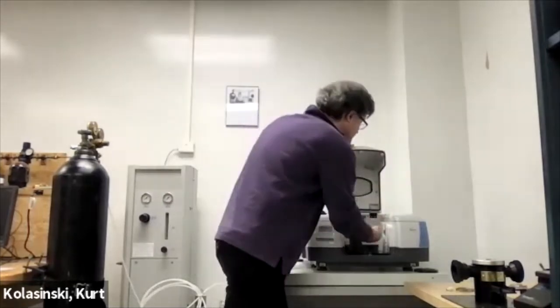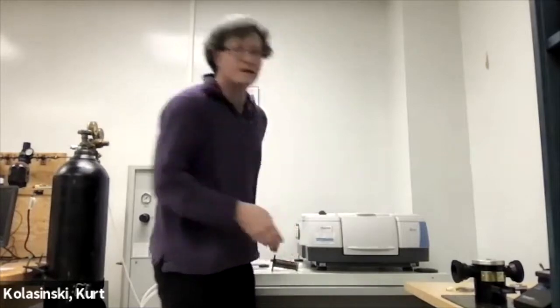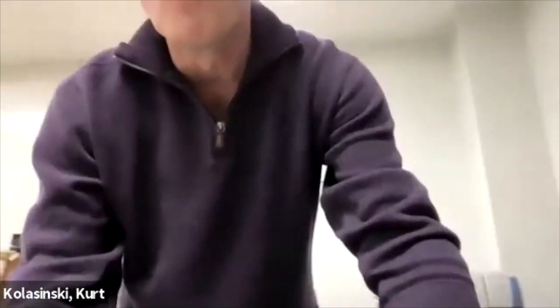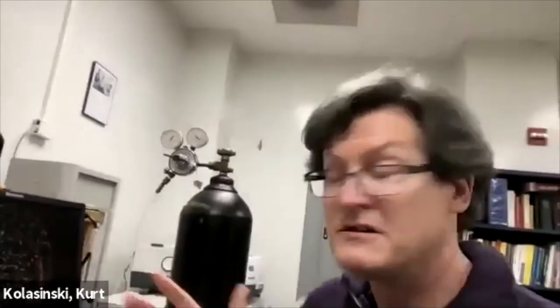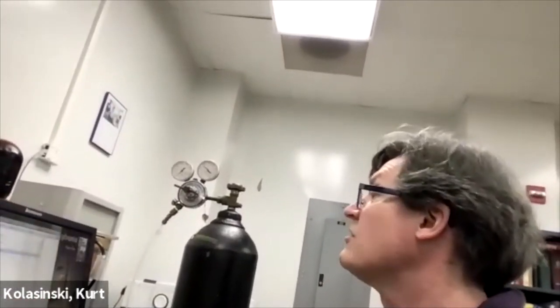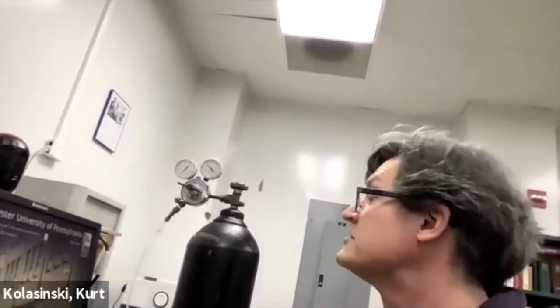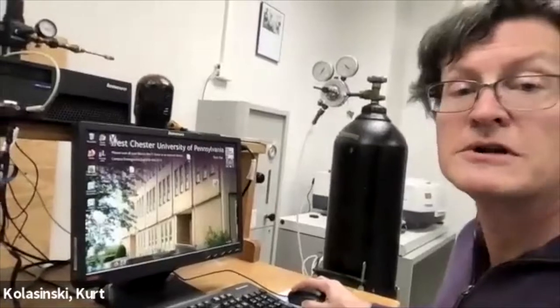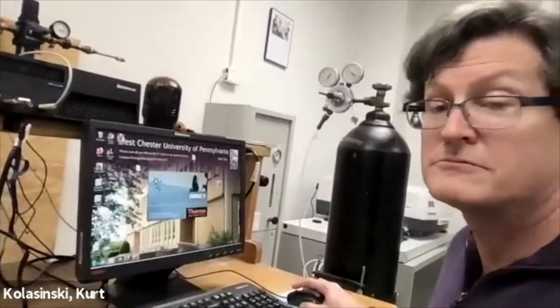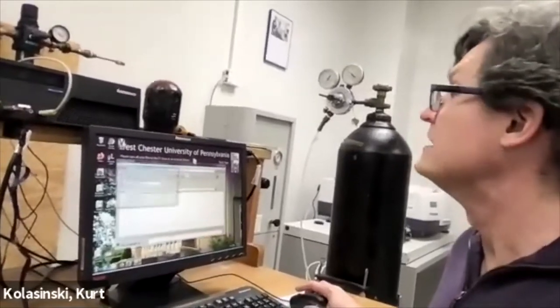For a background, let's just show you what a background looks like. Right now, we're going to take a background of just nothing in there, no cell at all. Okay, so the program that we use is called Omnic. I'm going to start up Omnic, which is the control software for this.